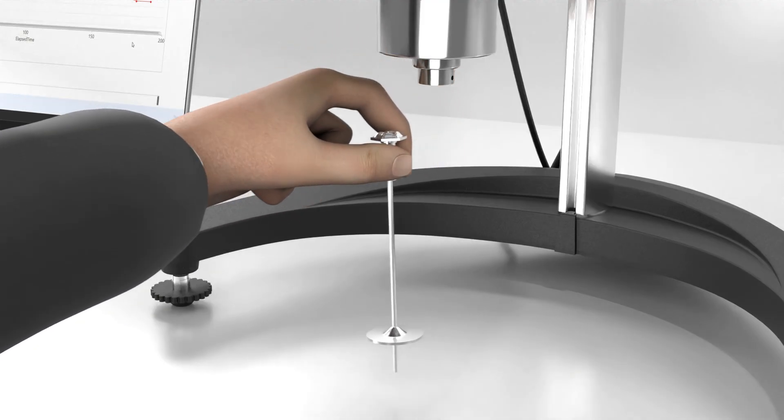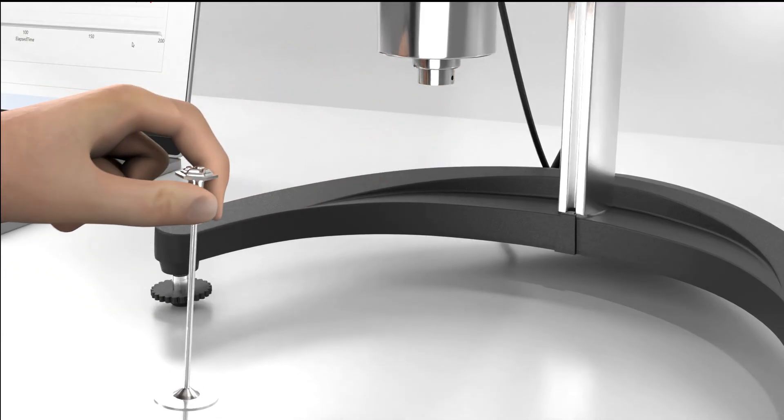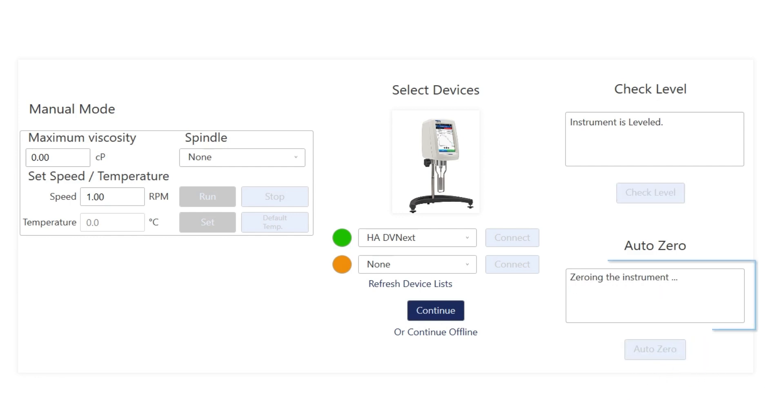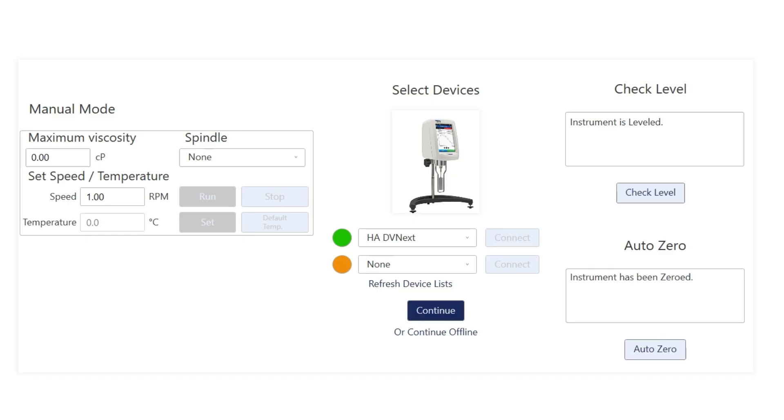Remove the spindle and press the AutoZero button. The instrument is now performing the AutoZero procedure. And now it's finished. The instrument is zeroed. Excellent.